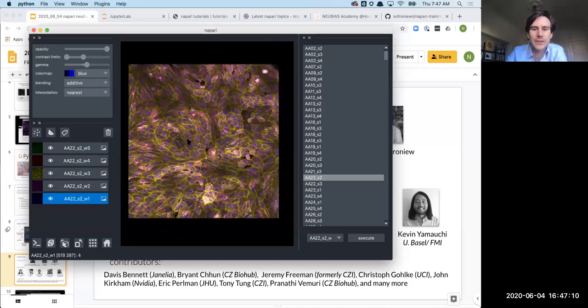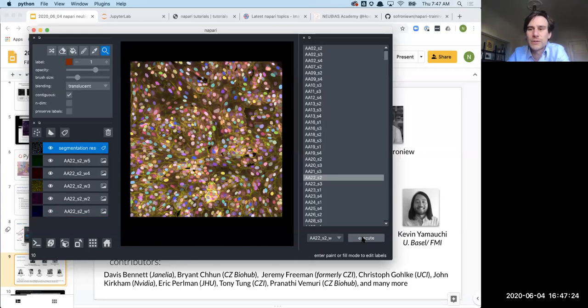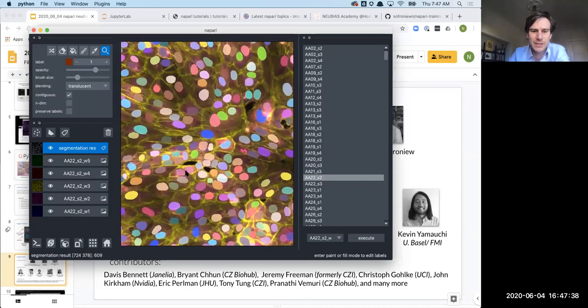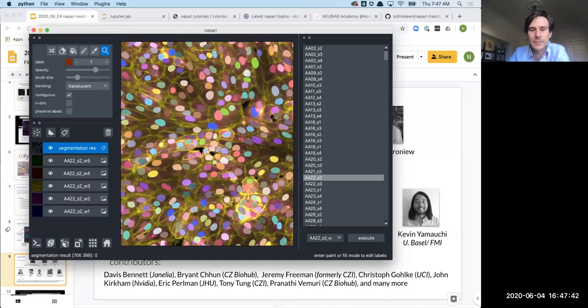All right. So as I was saying before, one of the exciting things is connecting to analysis and executing that analysis on command. And so I've rigged up a button here in the background that is going to call out to the StarDist segmentation algorithm. It's a very exciting Python TensorFlow-based segmentation algorithm, and apply it to the current field of view that I'm looking at, the nuclear channel. And so, applied to the nuclear channel, you can see it's really done an incredible job. That's all the credit to the StarDist developers.